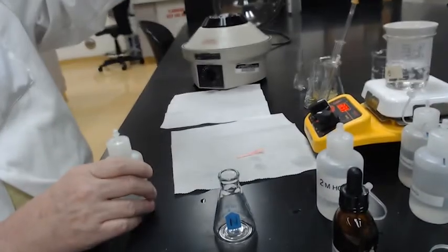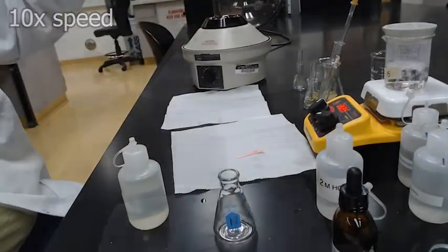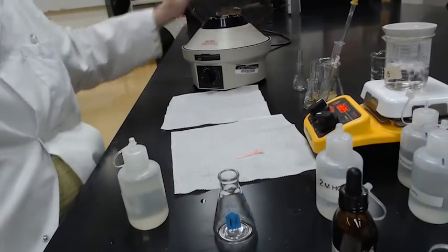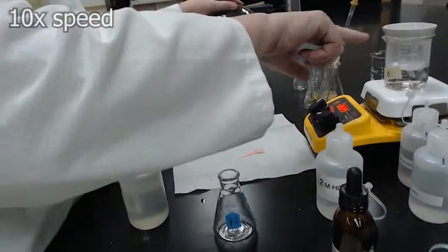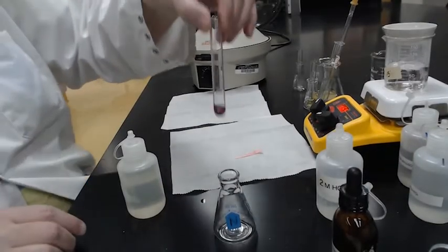Okay. This is why it looks suspicious. You can see it on the bottom. Okay, we're going to hold the white paper, but you see this bluish colored precipitate that's stuck on the bottom of our test tube? That is a positive result for magnesium. So I'm going to centrifuge it one time, and when I pull it out, I'll try not to shake it as much because I kind of mixed it up. It tends to all clump together. Can we see that blue little grouping right there? Yeah. Everybody see that? That looks like what we were supposed to see. Okay, so that's our magnesium test.